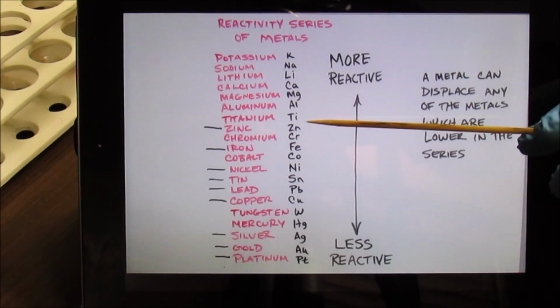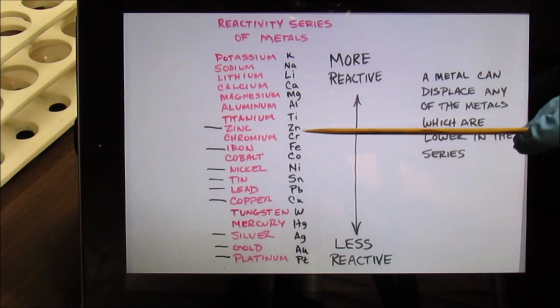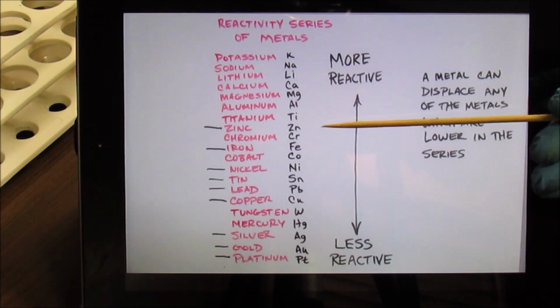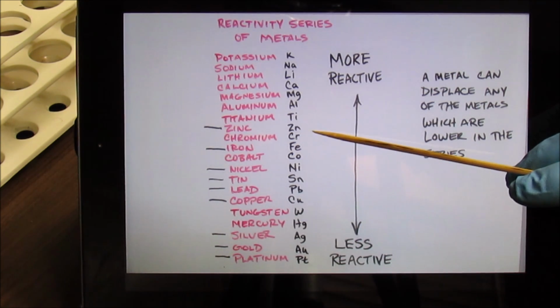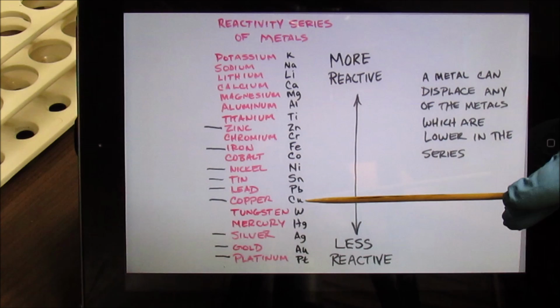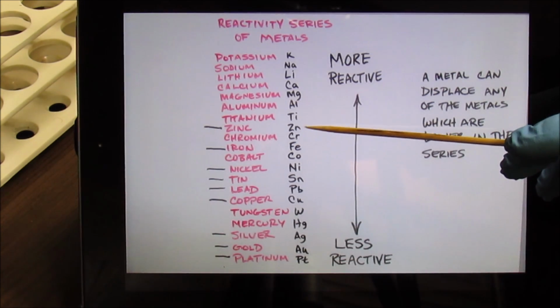The other way to go is I used a piece of zinc, which is way up here on the list. Zinc is much more reactive. You've seen as soon as I put the solution from the beaker in on top of that piece of zinc, it immediately began to react. That's because it's higher up in the series and more reactive. Copper's less reactive. So the way I'm thinking of going here is just go ahead, cement everything out on zinc, and then get everything as a black powder from the zinc cementation process, and then process the black powder from that point. It's going to be full of copper because the copper is cementing. Copper's down here below zinc, so anything below zinc that's in that solution is going to cement out and contaminate whatever solid material I get out of the cementation process with zinc.